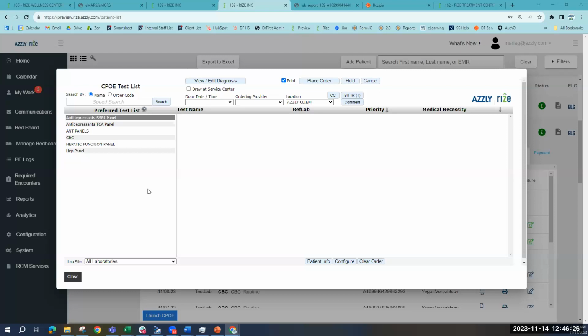Debra, I'm sorry. So auto-populating a billing code for point of service or not, it does include the insurance. Is that correct on the screen? Correct. Okay, so we will find out, Derek, if you still have to create an encounter for the lab in order for that billing to go through.